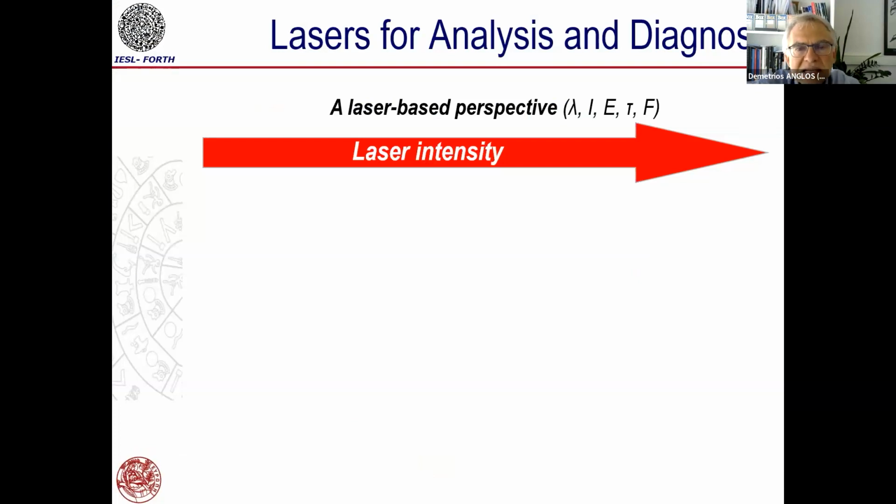So as we see in this slide, important for the interaction is the wavelength or the frequency, because this defines the amount of energy of the source that interacts with the material, and materials basically have characteristic transition frequencies, and we can probe those. And through those spectral transitions, we can actually understand things about composition and identity of materials and molecules and atoms and so on.